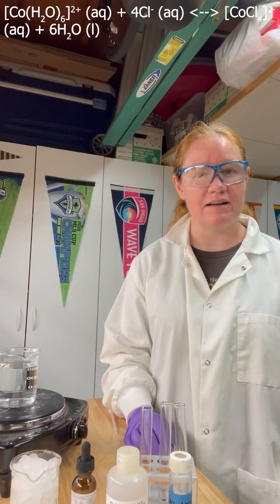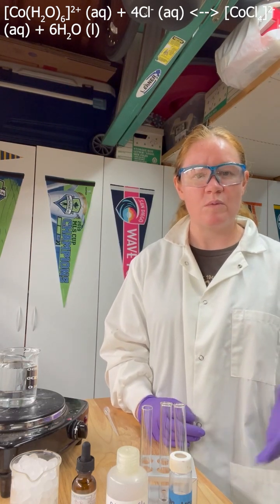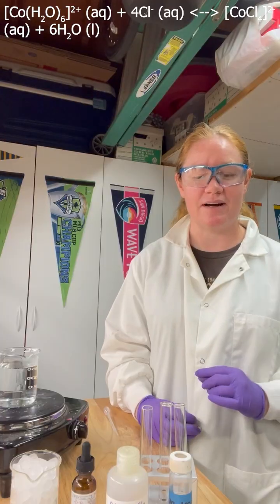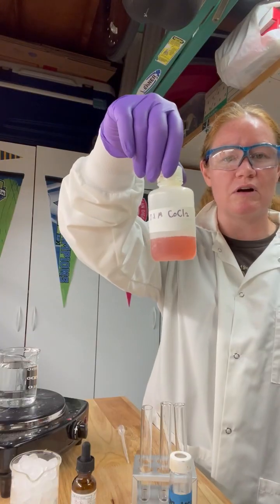So this reaction is pretty cool. It's very colorful. We're going to look at a pink hexaaquacobalt 2 ion and some chloride ions mixed together and see the type of equilibrium it establishes with the products, which is a tetrachlorocobaltate 2 ion that is blue in color and some water.